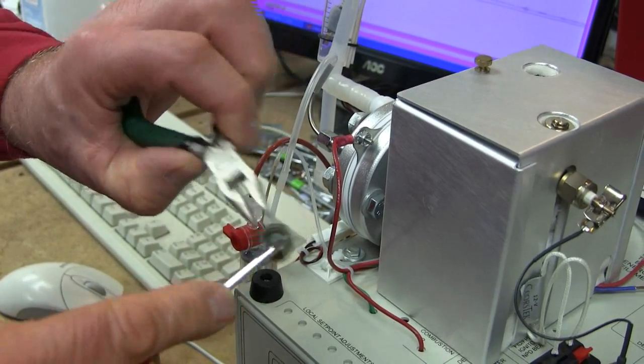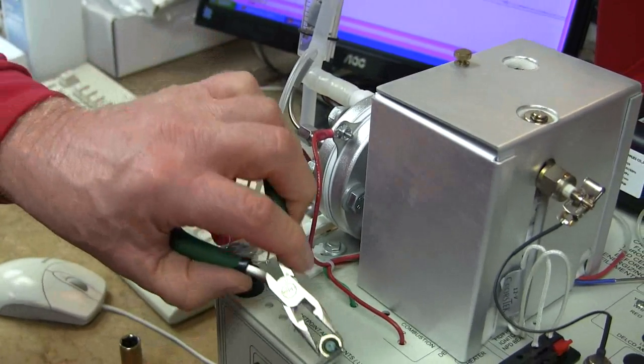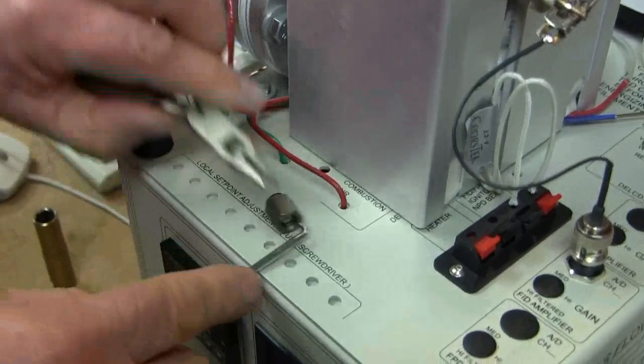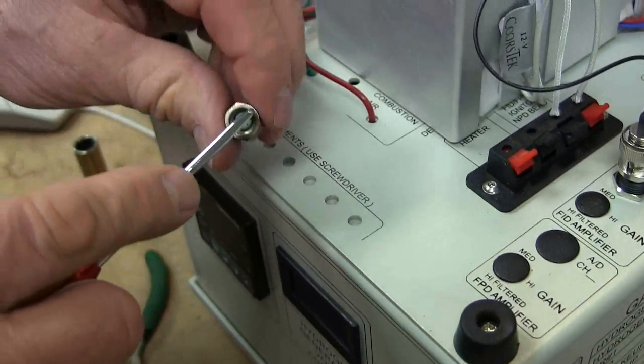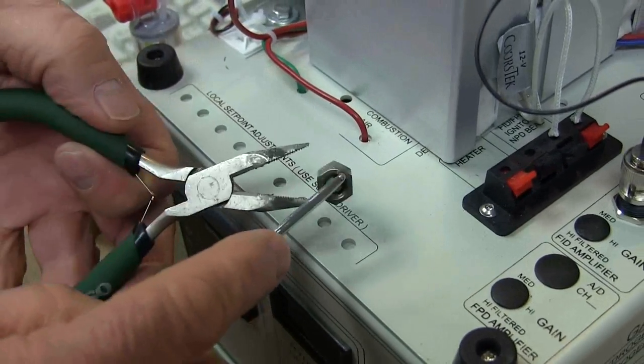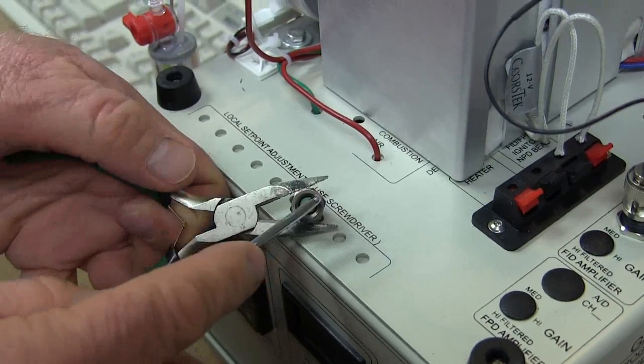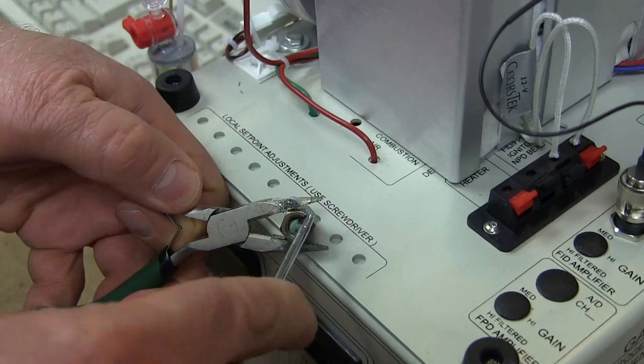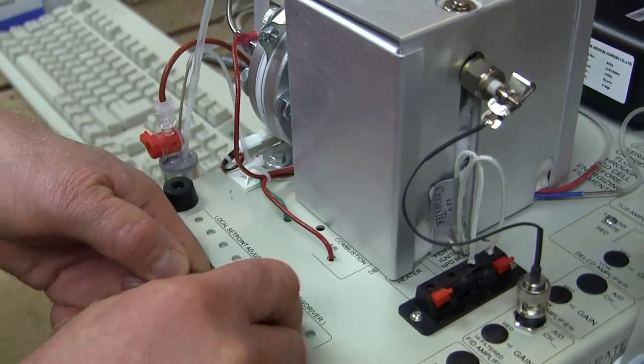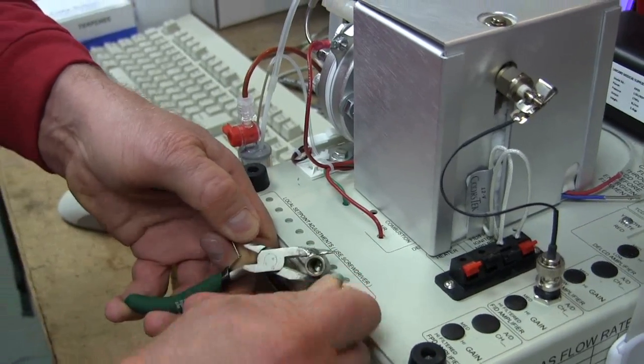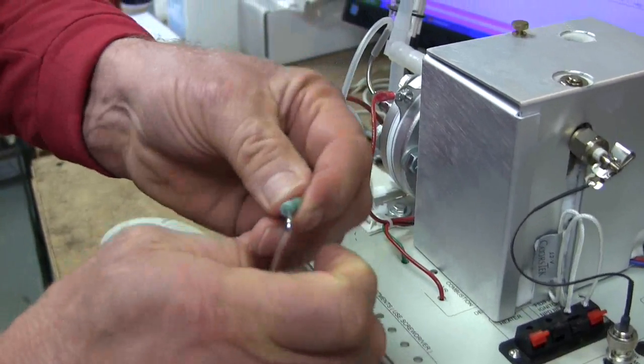So let's replace it. You need some kind of a hook thing, maybe an ice pick or something like that to dig the septum out. So we'll just hook onto that septum and then pull it out and it looks like this.